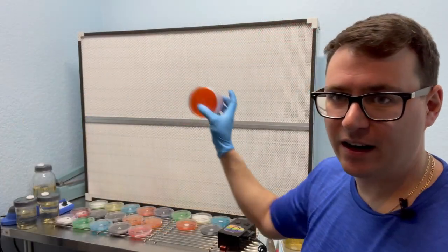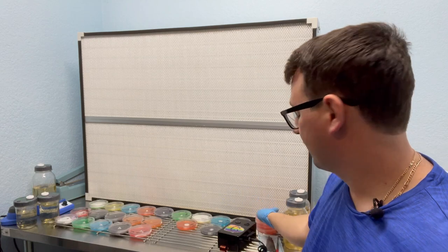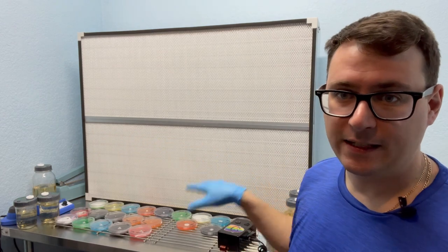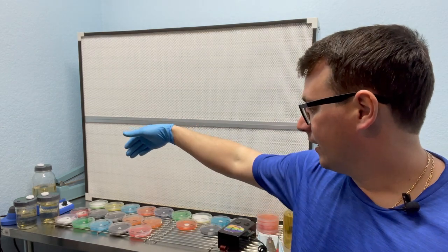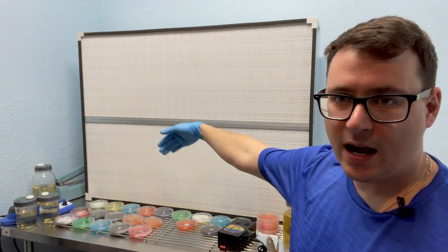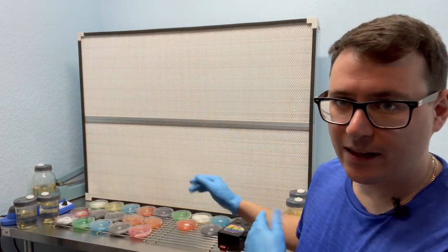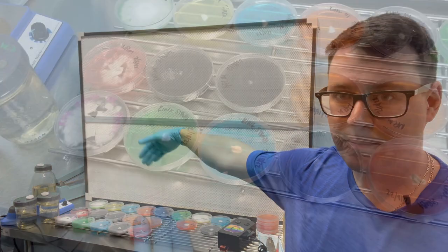But we also have our negative blanks, so just to prove if there was any contamination, that it wasn't the petri dishes. So all of our plates look clean, and then I will go through the different transfers, and you can see that in fact all of the King Stropharia did not cross into the lion's mane, and then you can tell that the two rhizomorphic oysters didn't have any crossover. It's super apparent on the petri dishes. So I'll flip this around and go through kind of what I'm observing.